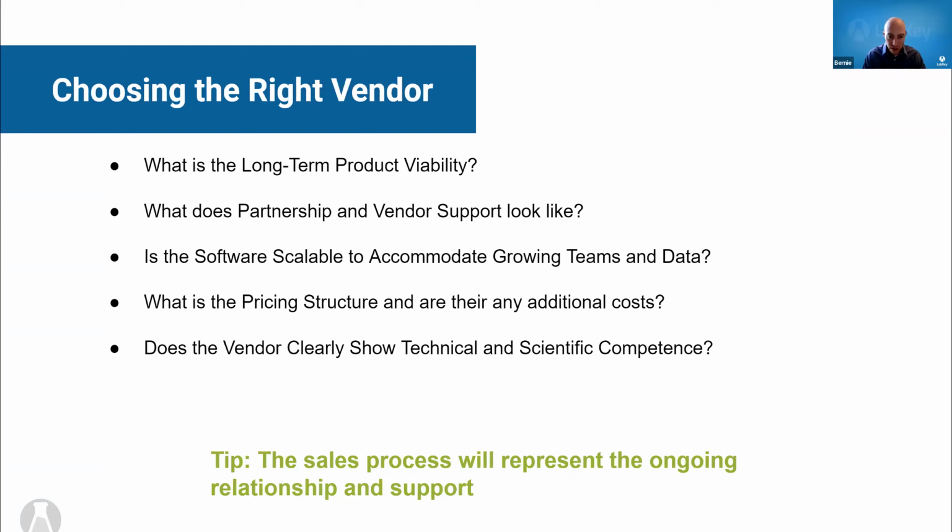Okay. And then lastly on this slide, does your vendor clearly show technical and scientific competence? This is of course relevant because you are scientists seeking a technical solution to a data or information problem.